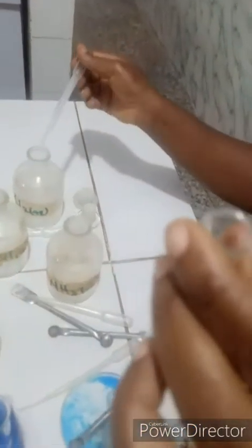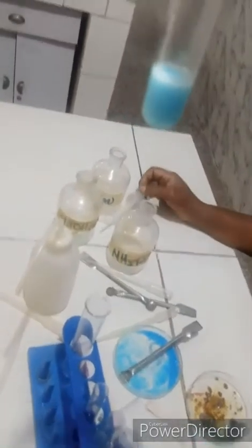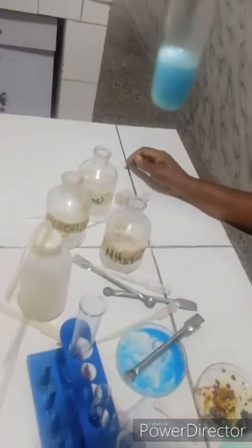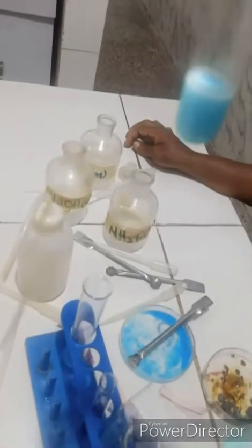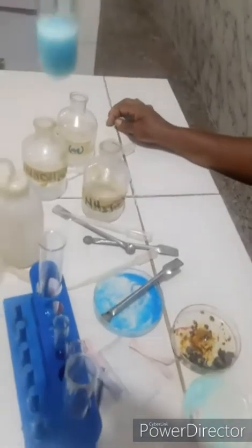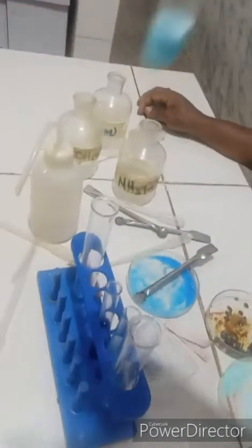Add barium chloride solution to the salt. You can notice the formation of a white precipitate. You can add more to note the white precipitate in the salt. The barium chloride has precipitated out barium trioxosulfate 4 and barium tetraoxosulfate 6. So our inference is that SO4 2- or SO3 2- is present in the salt. We are not sure yet of the particular one present.